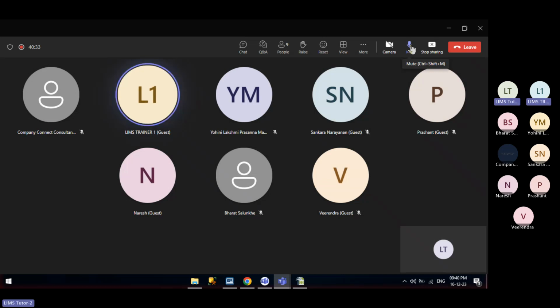Crystal Report is like starting from a blank page, a blank Word document, and then you can add tables and records from all the LabWare LIMS database tables. It can be a result table, the analysis master, or the user master. Using the combination of all these tables, you will be able to design very useful and meaningful reports in Crystal Reports.